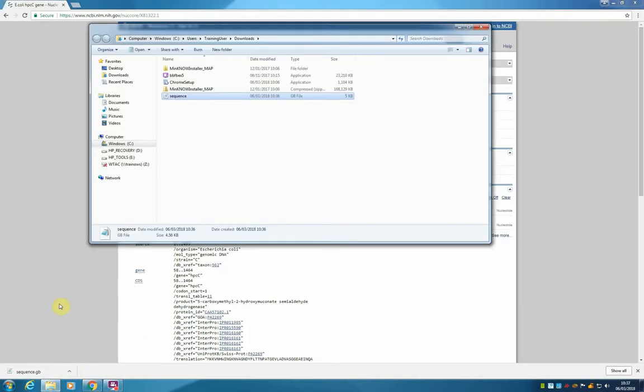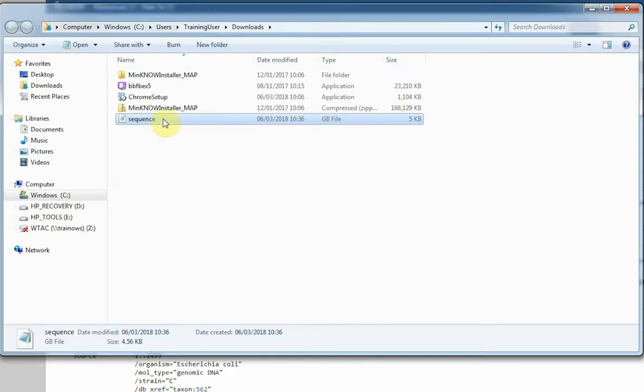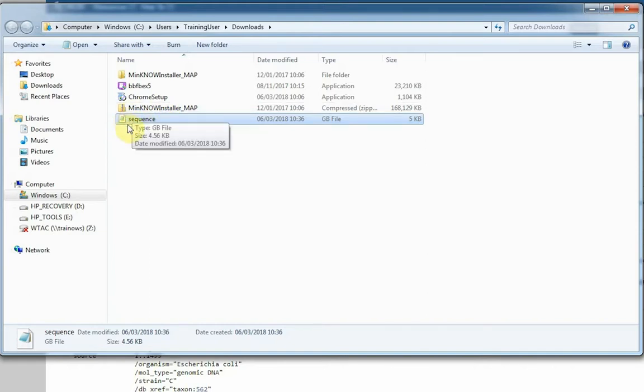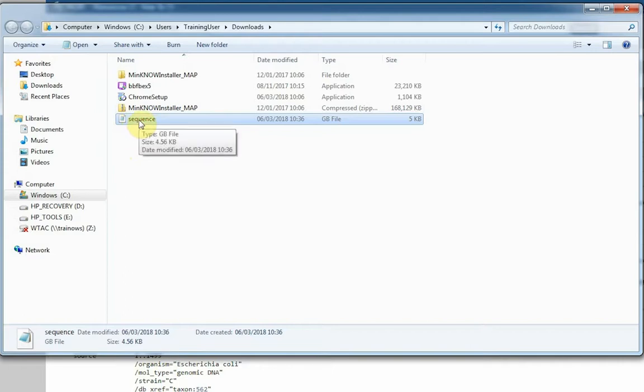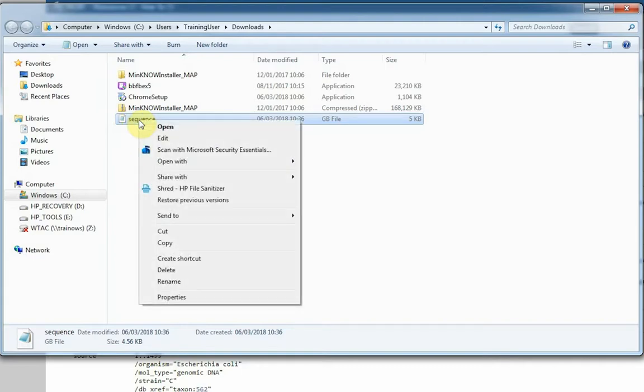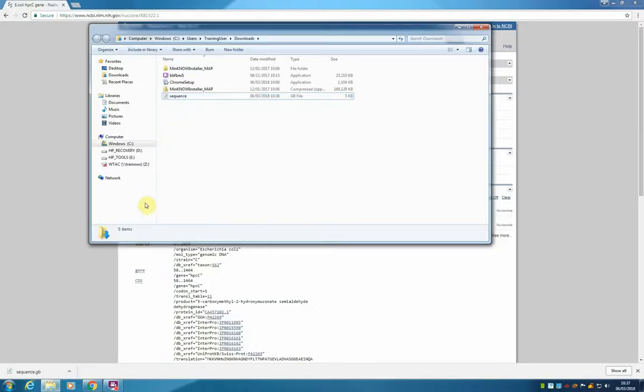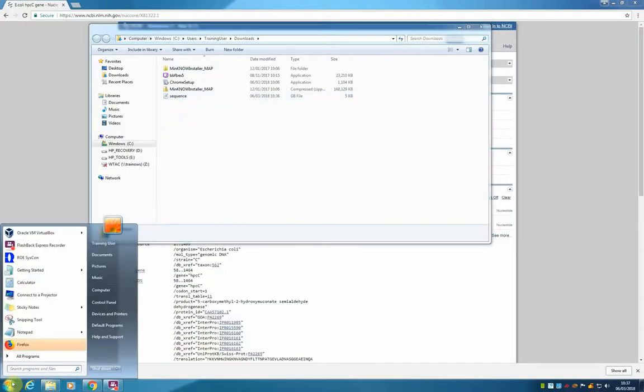I am going to find the file, and observe here that the extension .gb has been lost. We will need to open this in WordPad in our Windows example. For that I am going to open WordPad.